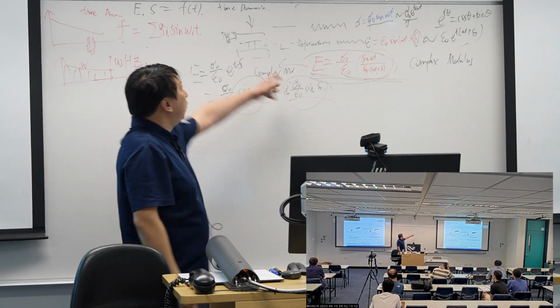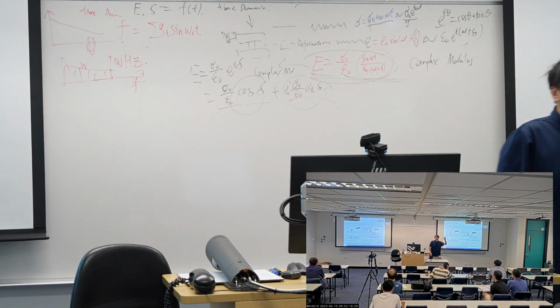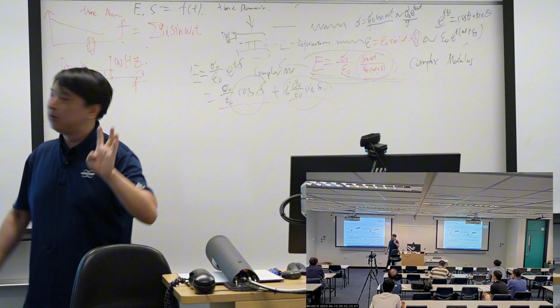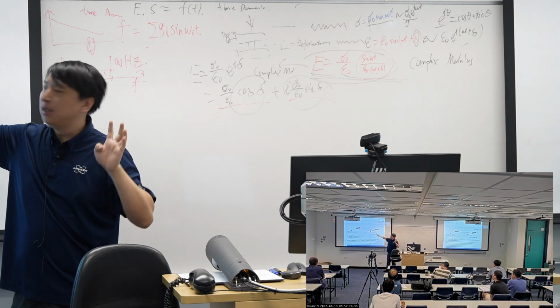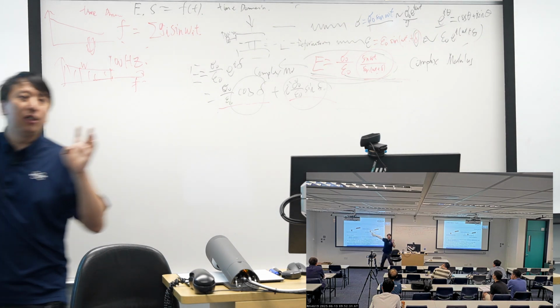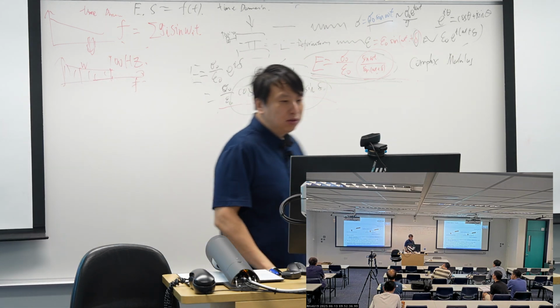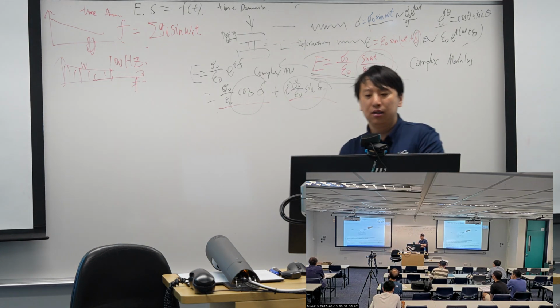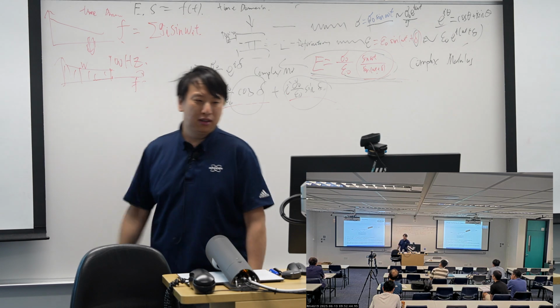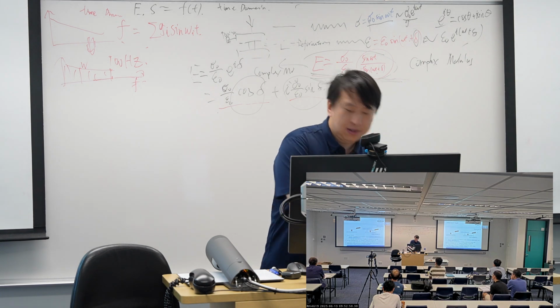So for the macro scales, they can directly measure the deformation. They can directly measure the force. We can measure the force from the deflection and the vertical. But for the deformation, we have to measure the Z and the deflection together. And then we subtract them, and we get the deformation. The mathematical process, if you take a look at the AFM manual, is relatively long, so we write it down in such a way.